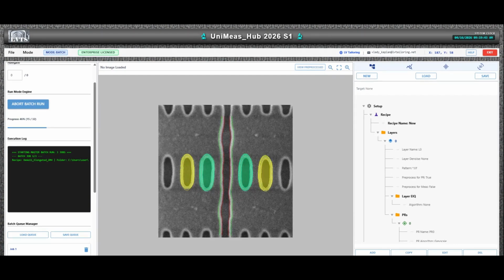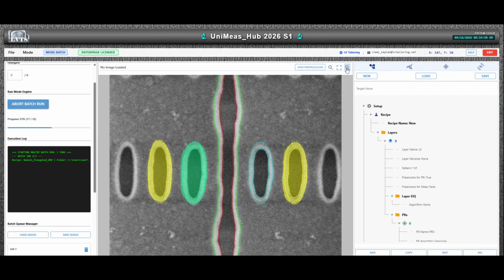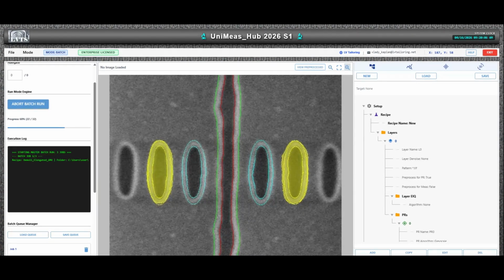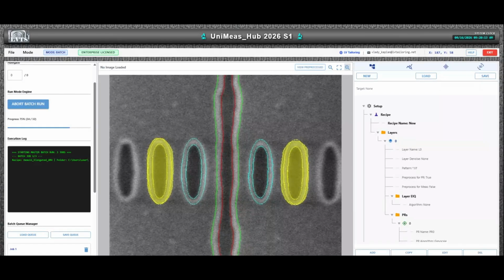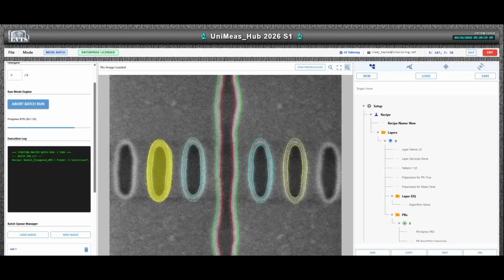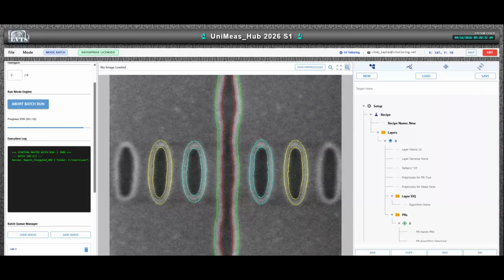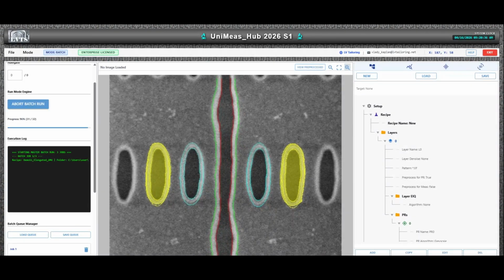The batch engine also features robust error handling for missing data. If it fails to find a match, it simply returns 0 matches. Rather than triggering a fatal system crash, the batch runner safely catches the empty array, gracefully skips that specific measurement step, and proceeds to the next item.